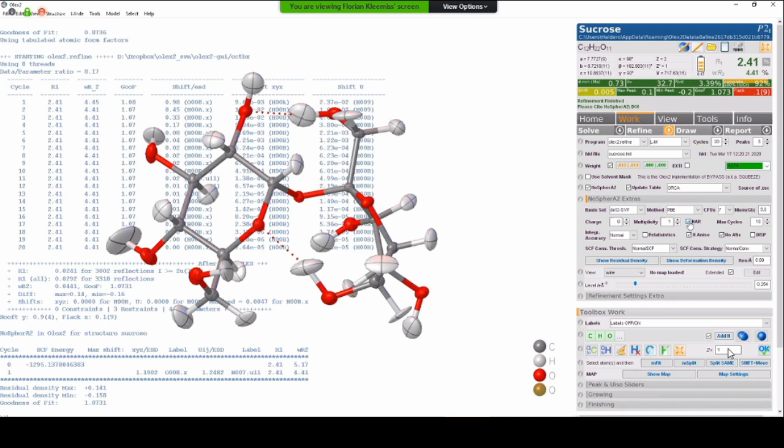If you tick this one, it will basically do the process over and over again. So it will do a wave function calculation, partition, refine, and now calculate a new wave function based on the geometry that you obtained after refinement. And the good thing about this is it will use the wave function that you calculated in the previous step as the initial guess for the new wave function calculation. So hopefully this will save you a lot of time and energy.